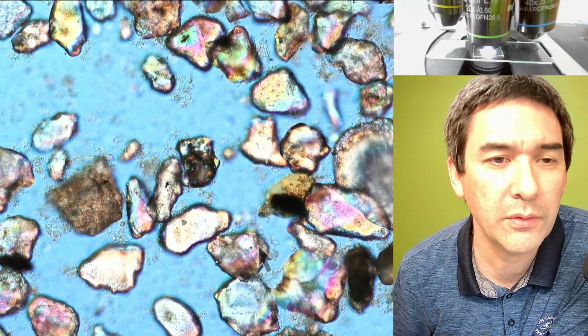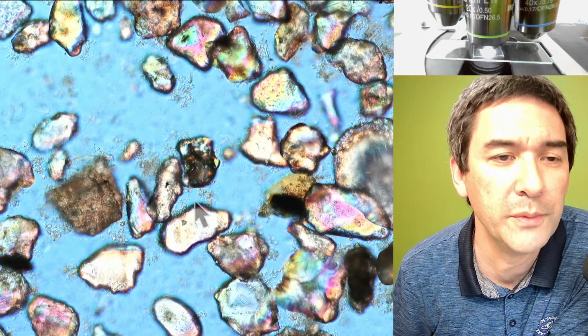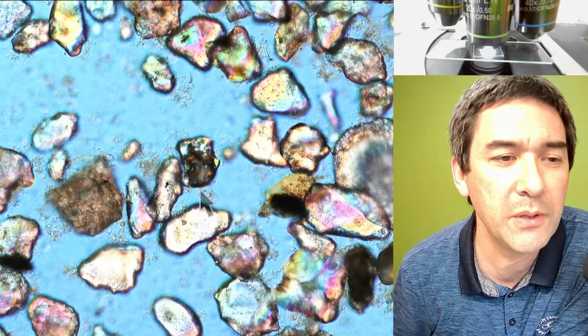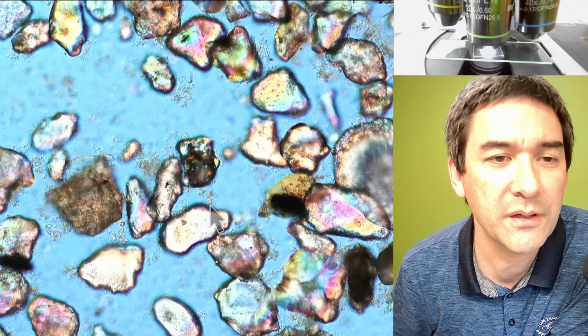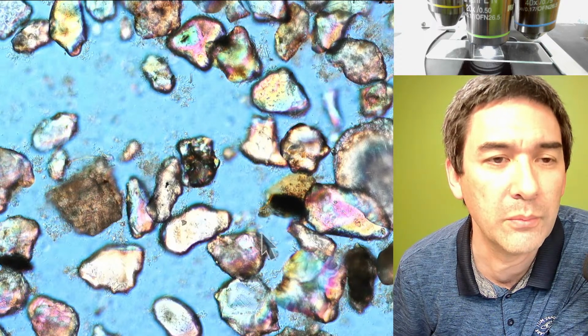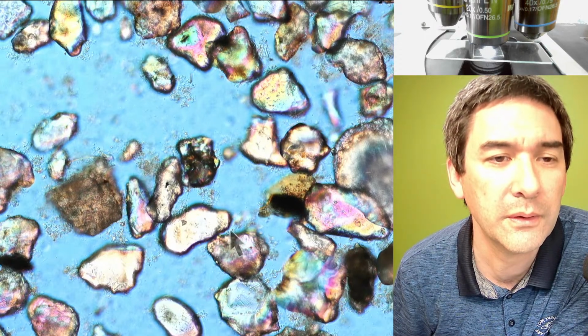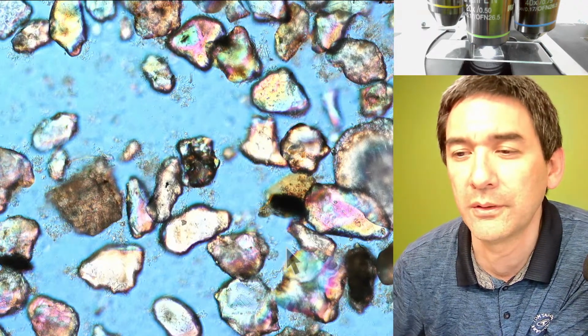Can I move the arrow? There was just a short time ago a little bit of movement here, and in many cases it's because there are some diatoms or some other small microorganisms that are pulling and pushing some of the sand grains, but there is actually not a lot of movement here.